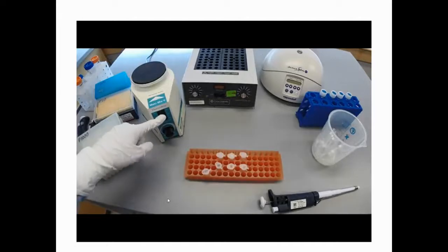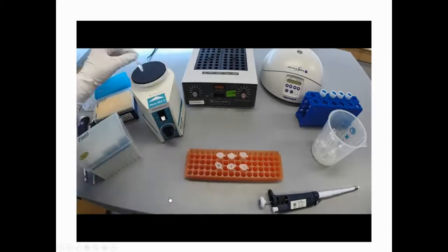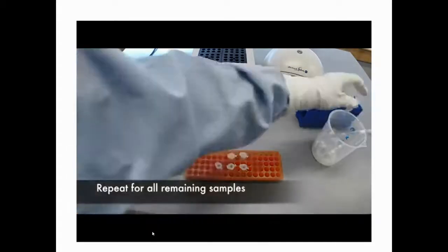Press the switch down to touch and turn the knob clockwise to ensure maximum speed. Hold one tube at a time and press the top of the black pad to initiate vibration. This is what we normally do in the lab, use the vortex to mix. Repeat this process for all remaining samples.